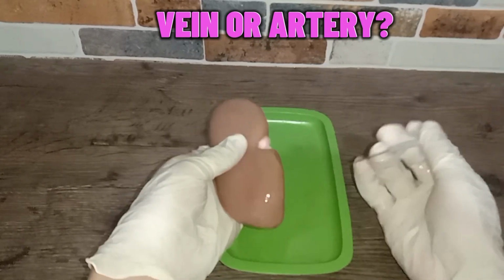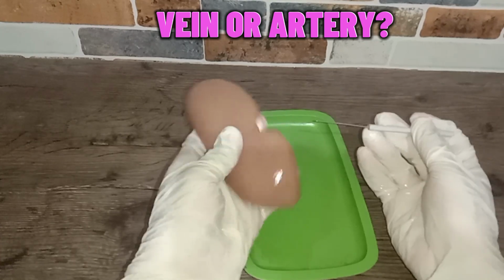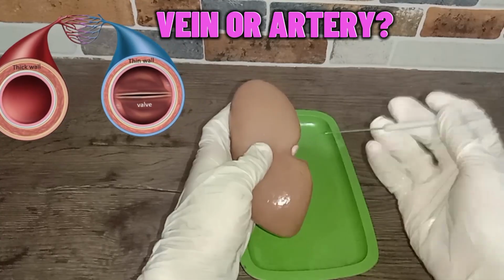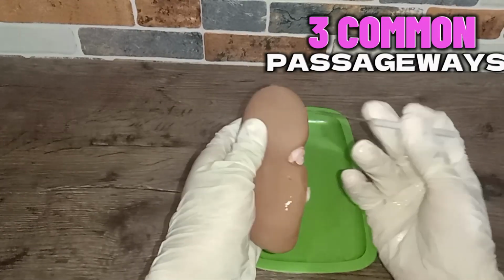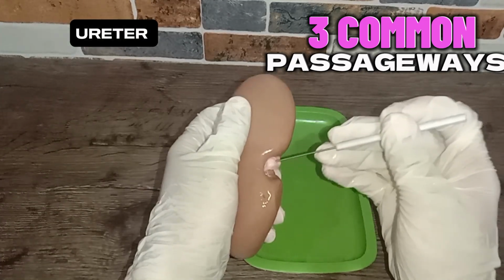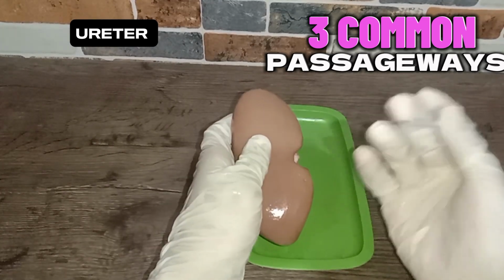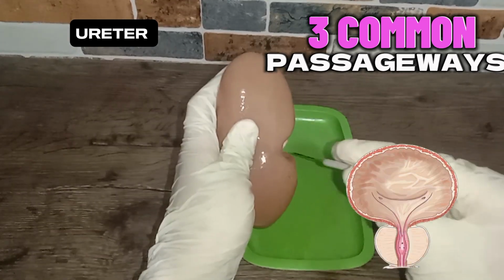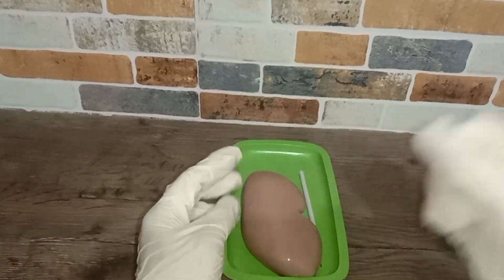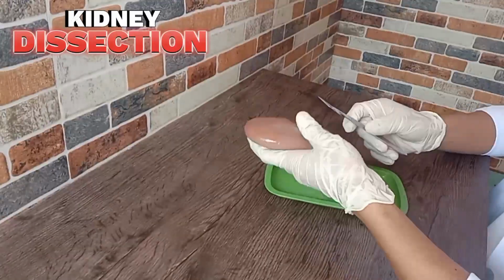Okay, so the question here is, how did I classify them? So as we go back to our previous discussion, we have learned that the walls of the arteries are thicker than veins. So, as simple as that. And moving on to the last external part of the kidney, we can see here the ureter right here. This is the ureter. Okay, so the ureter carries urine from the kidney down to the urinary bladder. Okay, so now that we are done locating the external structures of the kidney, we can now proceed to the dissection. Okay, so let's start.